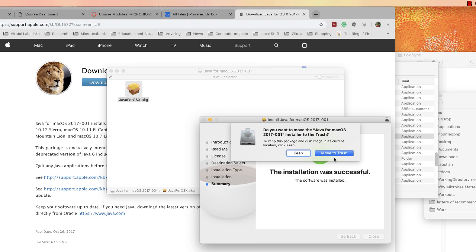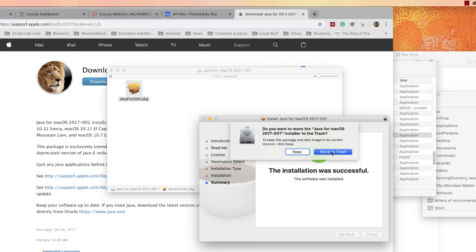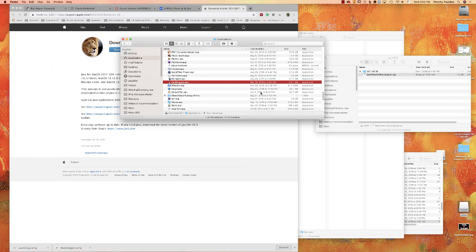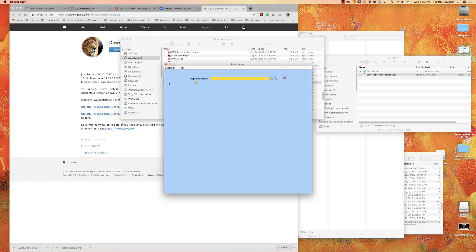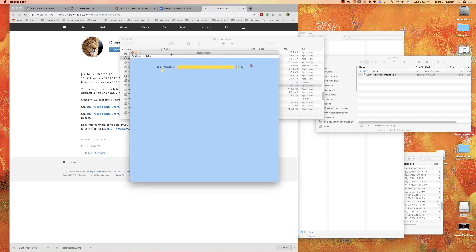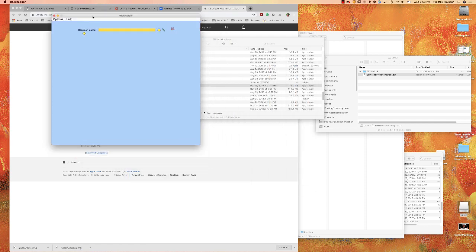So now that we've done that, you can close it and move it to the trash. And now if we go back to RockHopper and launch it, it should launch. And there we go — we now have the RockHopper application working on our computer.